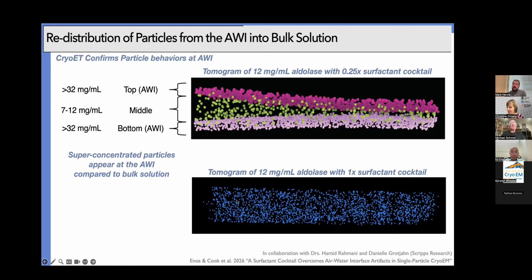We have had one group reach out to us who are doing filamentous MOFs, these metal-organic frameworks, where they don't have very large symmetry across the filaments, and so they do need help kicking the views around. But for anything where you have a higher lattice geometry, then you shouldn't have to worry about it as much.